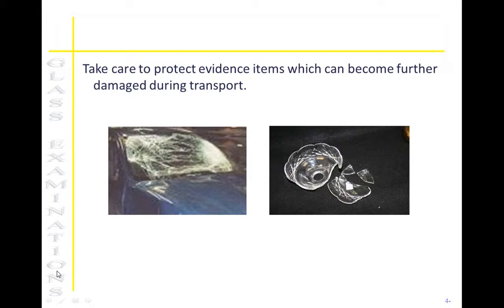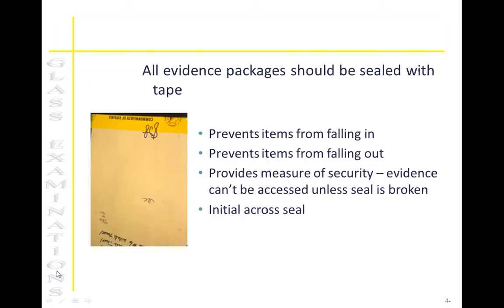Also, for physical matches, this is very important. You don't want that glass to continue to break before the analyst has the opportunity to work on it. Once again, you always need to make sure that your containers are adequately sealed. So seal them with tape and then put your initials over that tape.